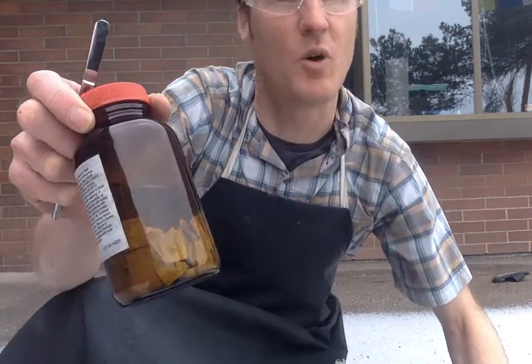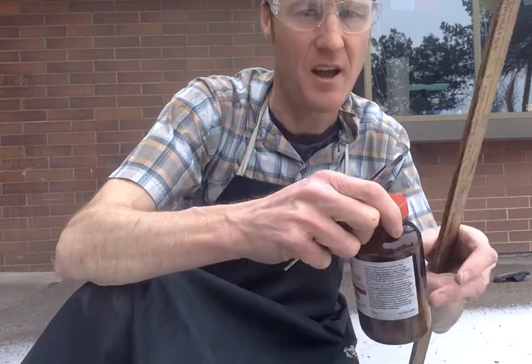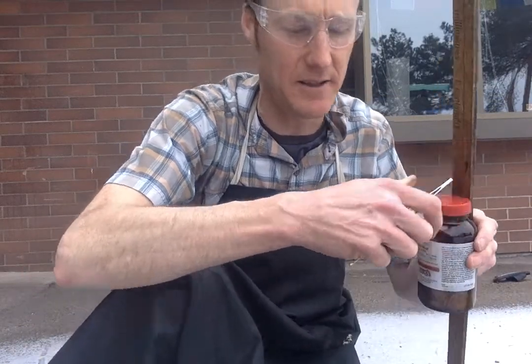Sodium is kept in mineral oil because otherwise it will react with anything else, including air. I'm going to put a bit of the sodium onto the tip of this meter stick, and then I'm going to tip it into the water at a distance.